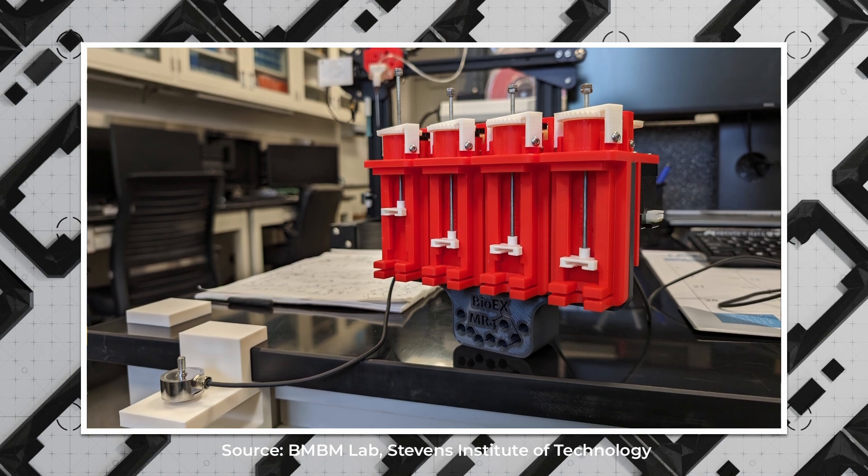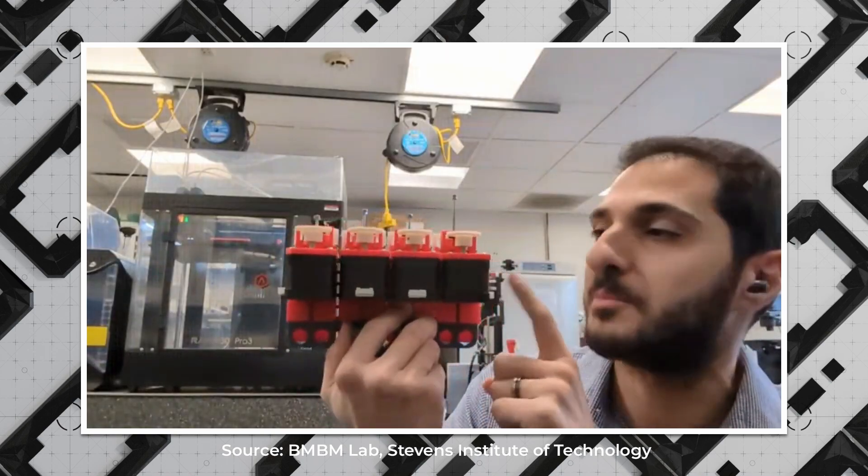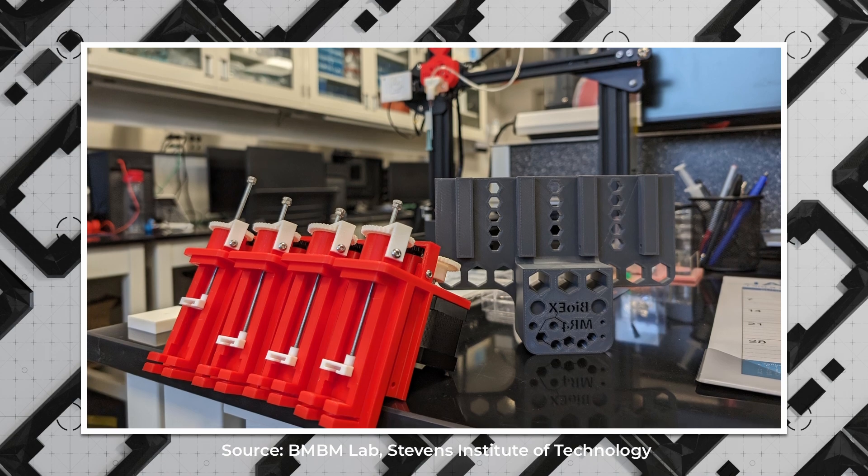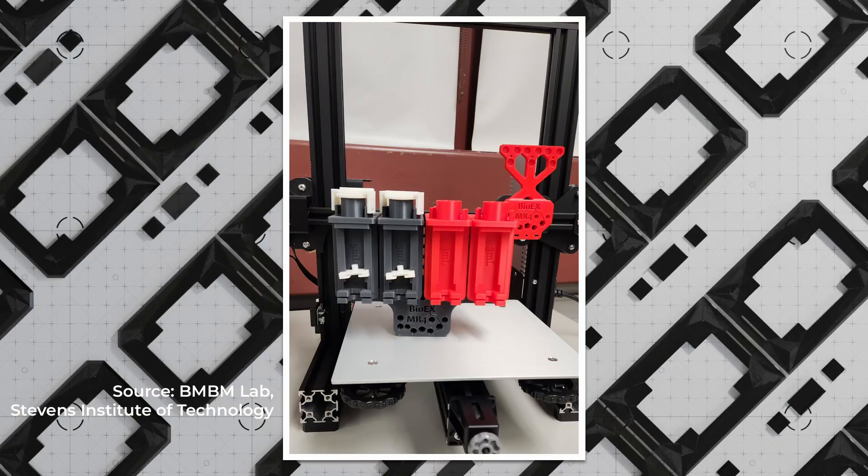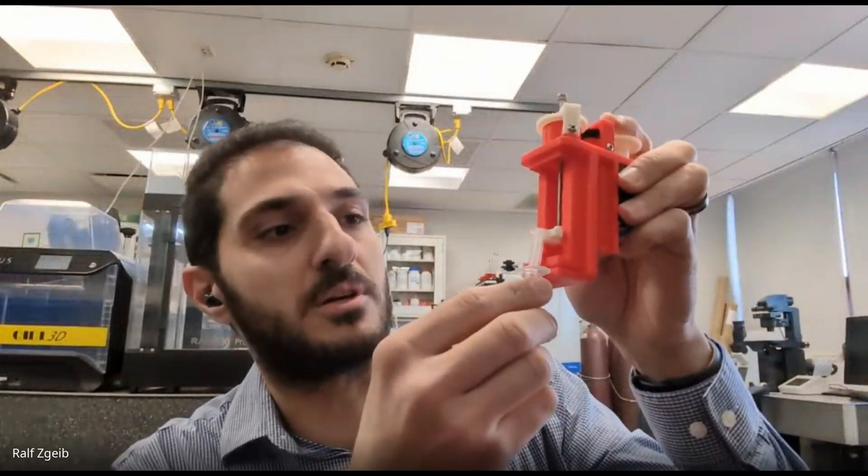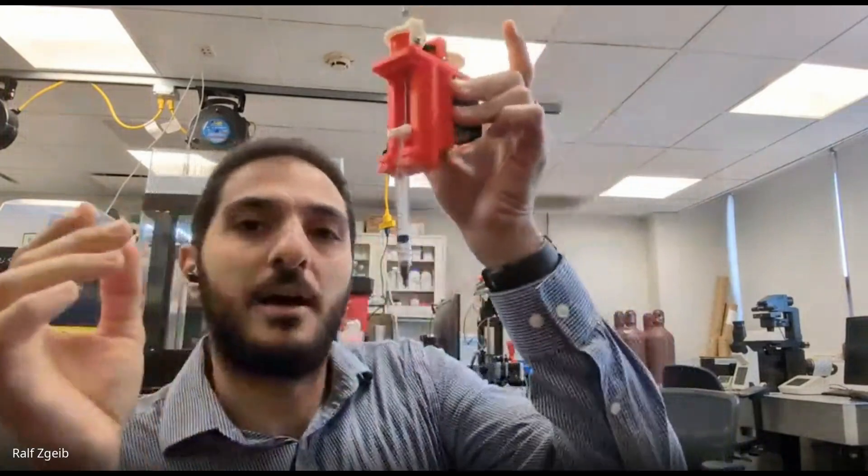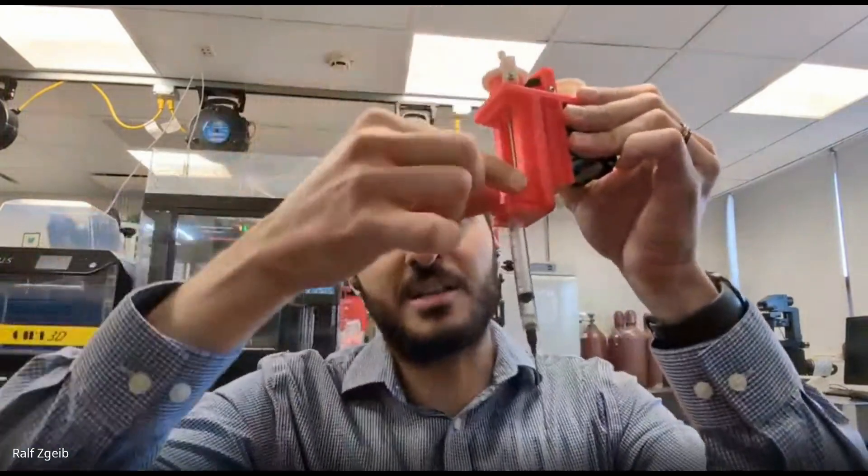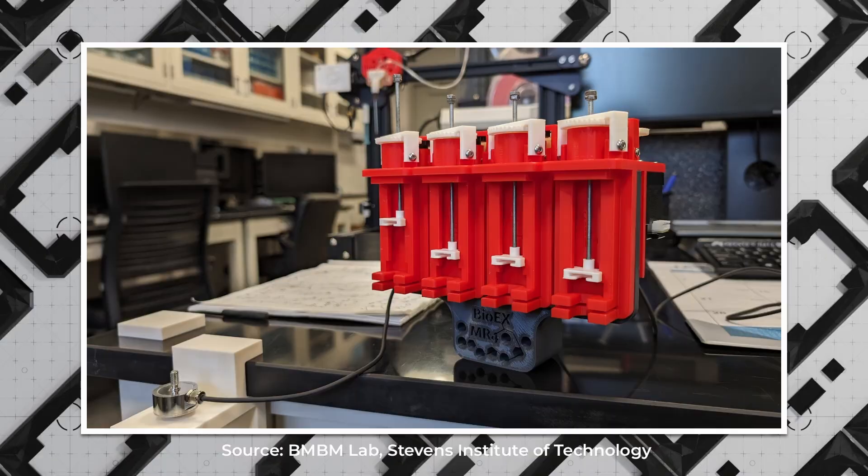We have developed this quad extrusion head, and it's all made of 3D printed parts, except the extrusion stepper motors in the back. This is all 3D printed on the RAISE 3D. We install this on any open source 3D printers. It can go into this extruder that we designed, and now this can be controlled in extruding the material inside this syringe.